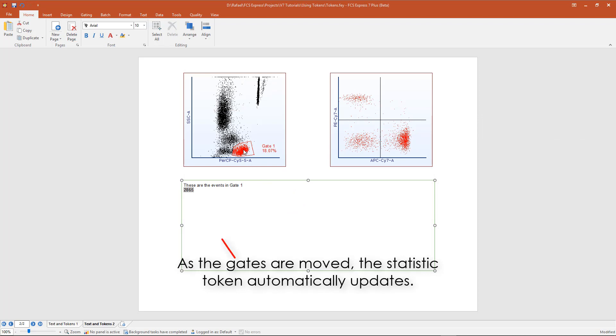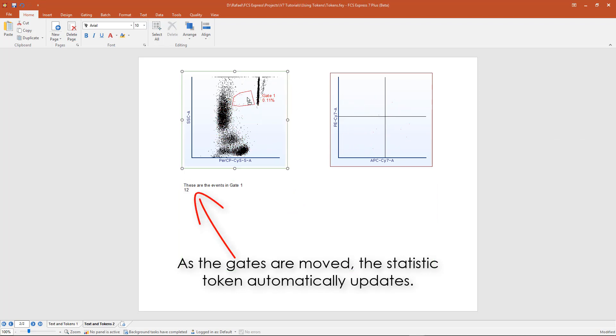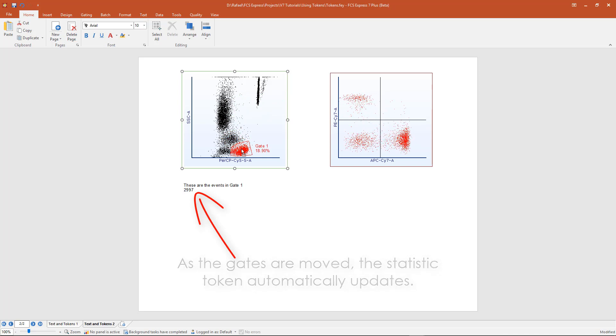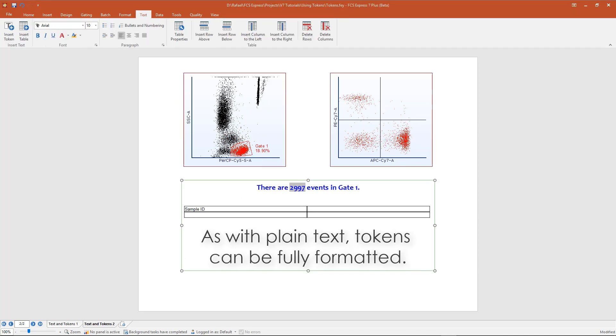As the gates are moved, the statistic token automatically updates. As with plain text, tokens can be fully formatted.